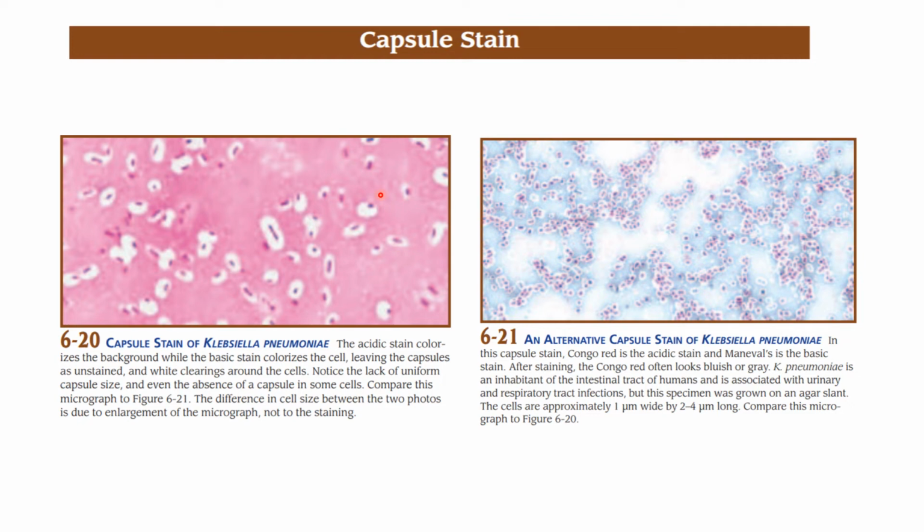So it detects cells that are capable of producing this extracellular polysaccharide known as capsule. And capsule production is important for some microbes because it's part of their virulence. Like Bacillus anthracis, the one that causes anthrax. And of course, we have Streptococcus pneumoniae, the one that is known to cause pneumonia. They have a capsule, and this capsule makes them less vulnerable to phagocytosis.